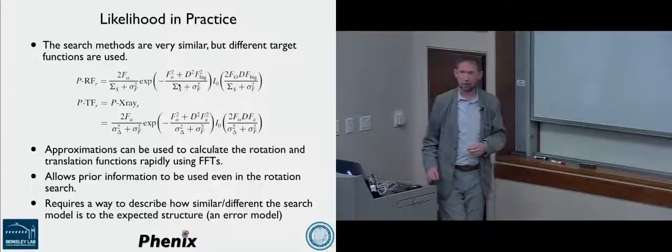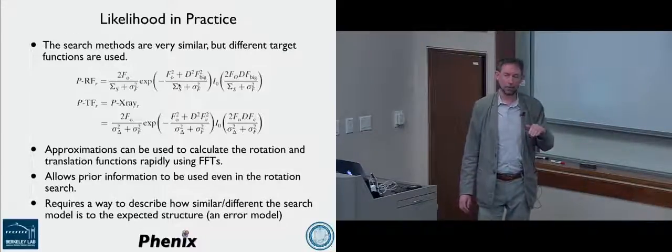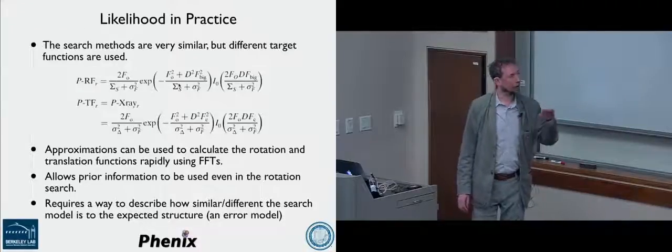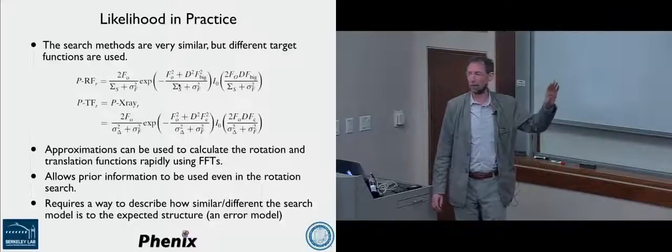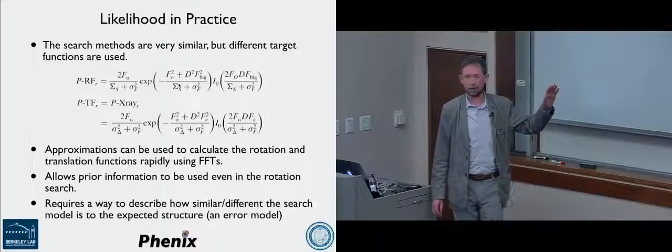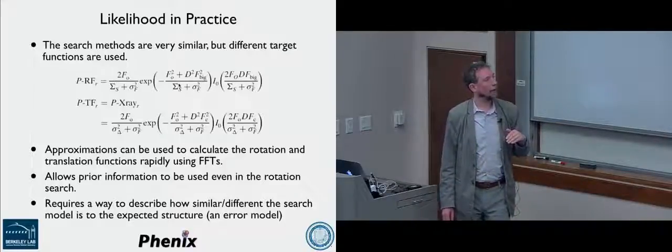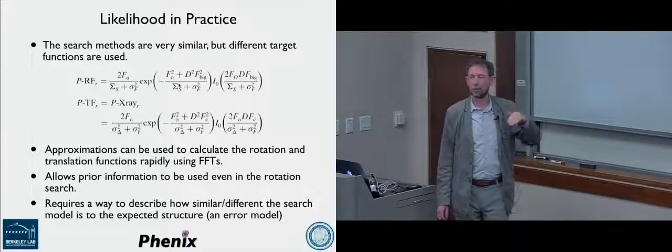It turns out these are slow to calculate. So in practice, during the molecular replacement, say in Phaser, slightly modified forms of these scores are used to make it quick, so they can be estimated by fast Fourier transforms, for example. But at some point in the process, which we didn't talk about this morning, the full forms of the likelihood function are used to rescore things.